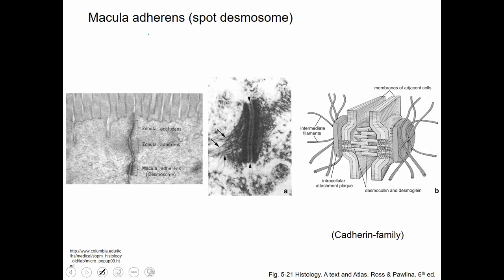But the other one that's really important is the desmosomes. Desmosomes are the only junctions you will appreciate by electron microscopy as very dense, spot-staining areas in the lateral wall. Here's a higher electron micrographic view of them. Two different cells, cell A and cell B, and this electron-dense material represents the desmosomal complex between cells.